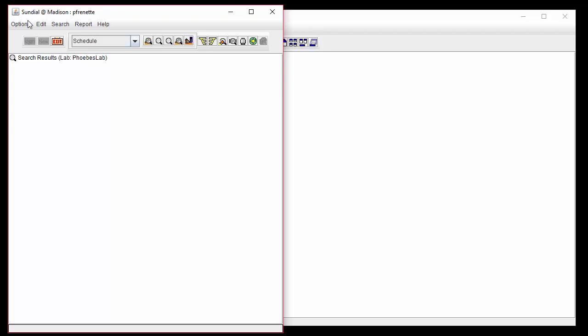To place a service request at your lab, one has to have a permit. The permit determines the person who can place a request, the person who will be paying the bills incurred by the request, and the funds used. This allows users to order services from a lab like the NMR FAM, for example, to request time on spectrometers.